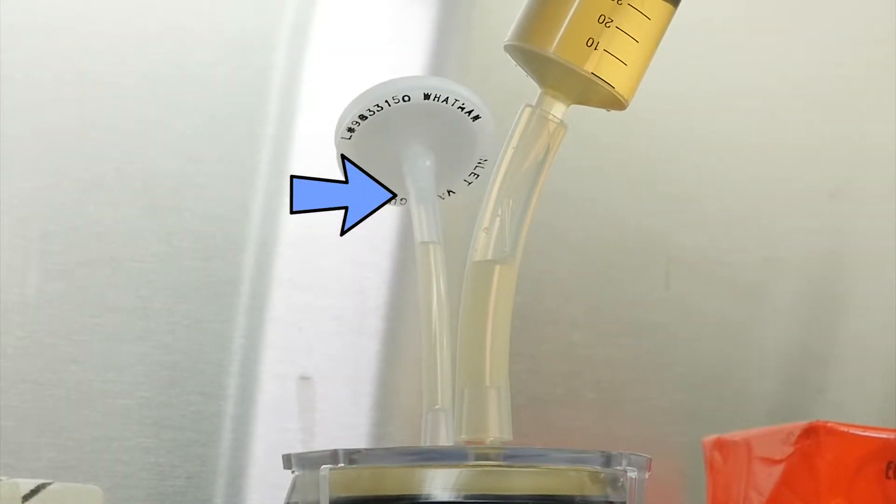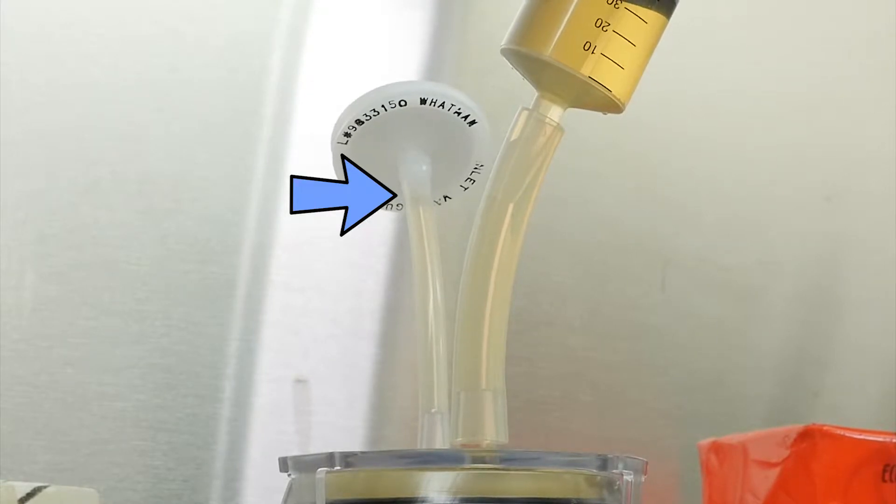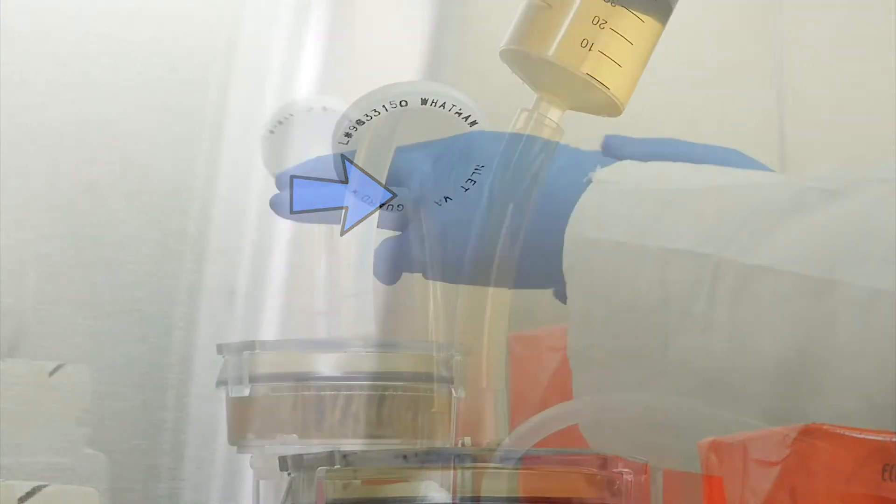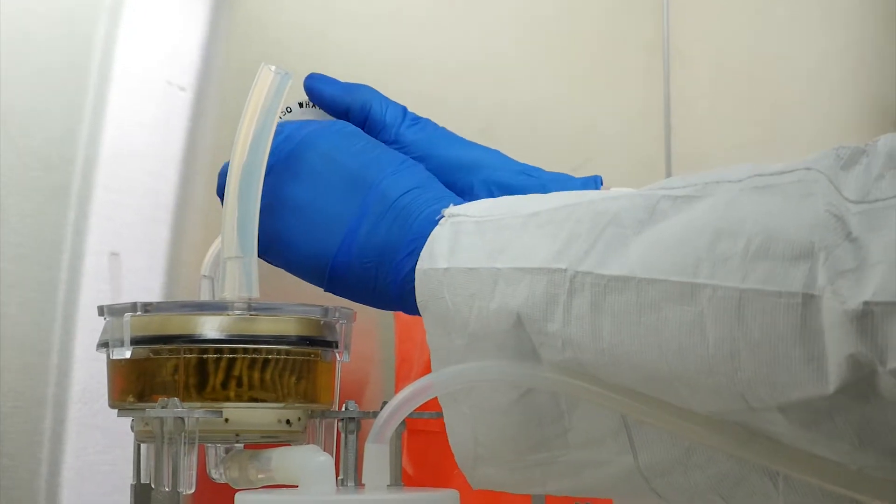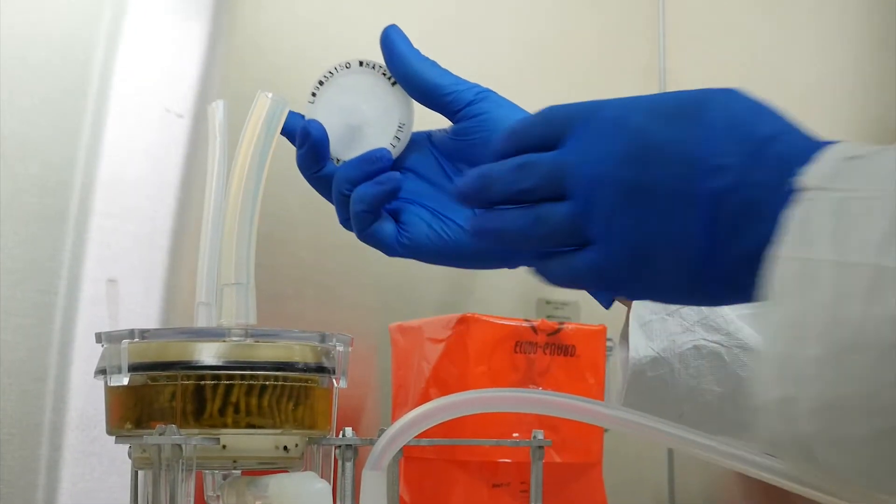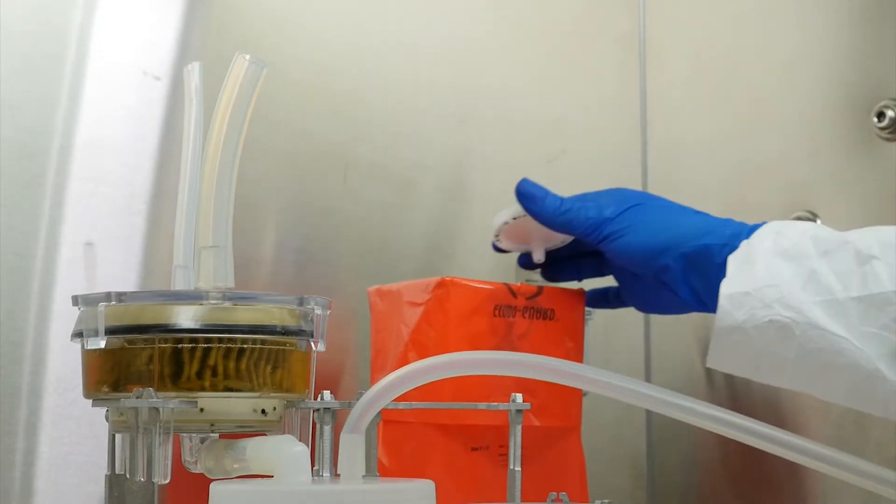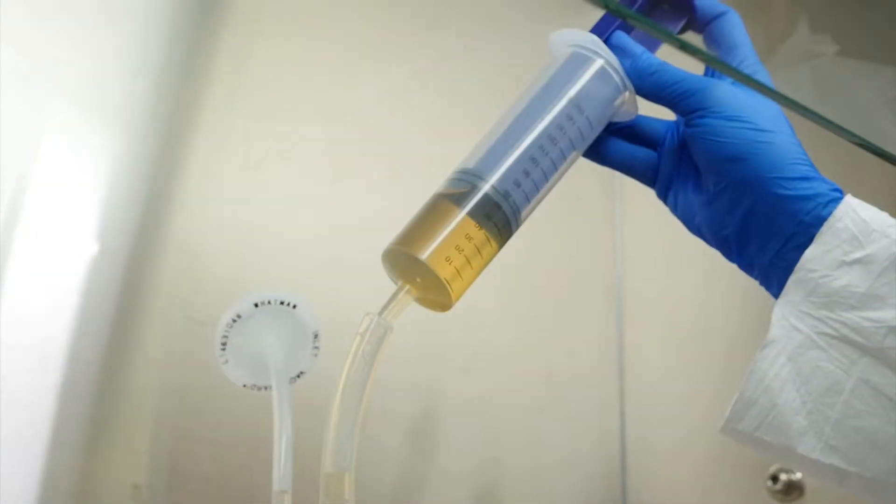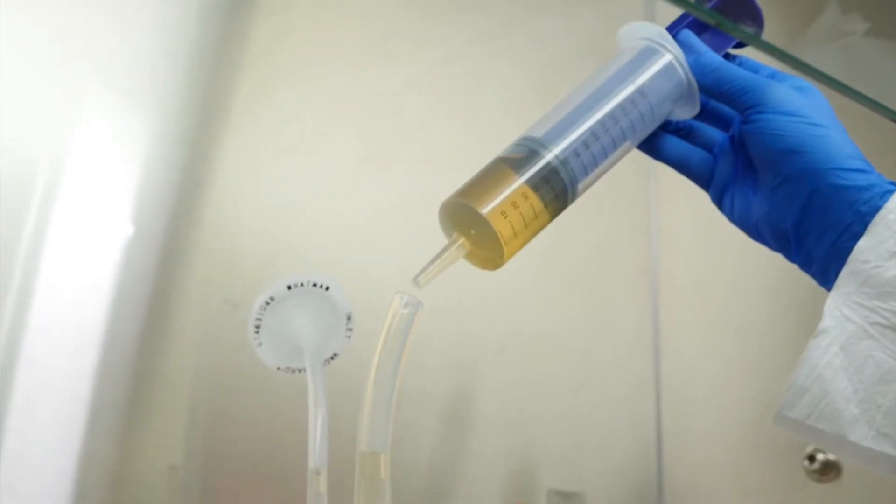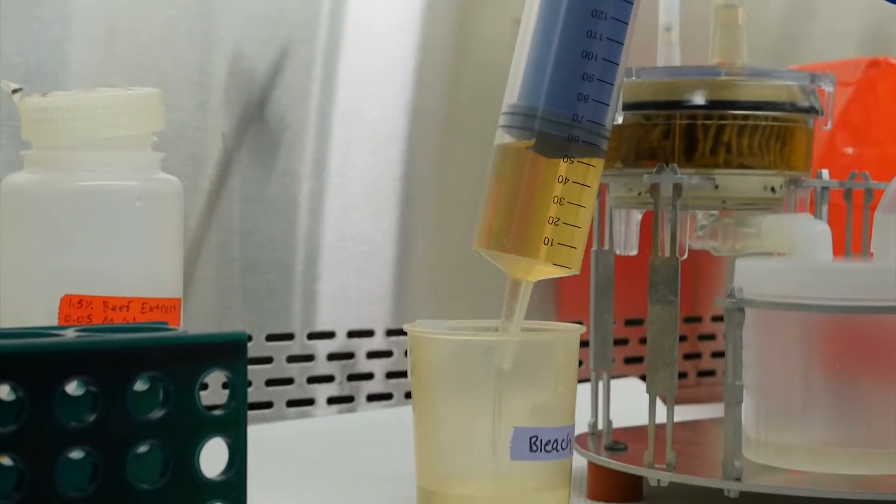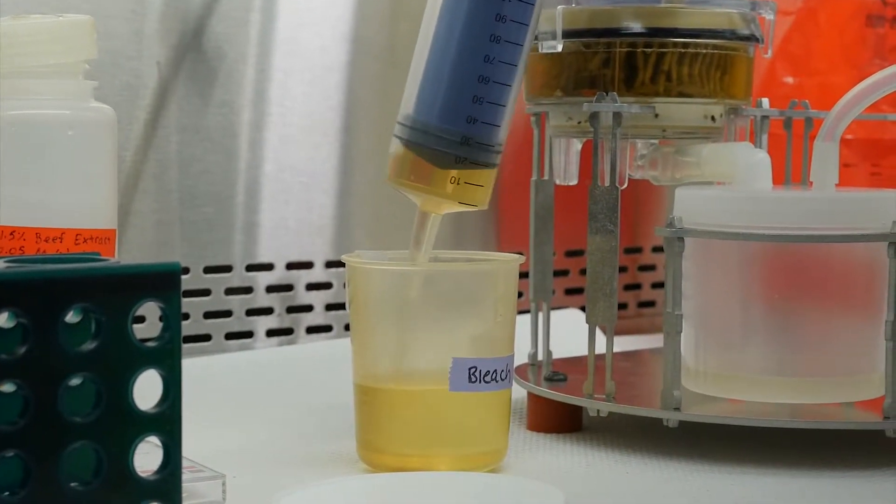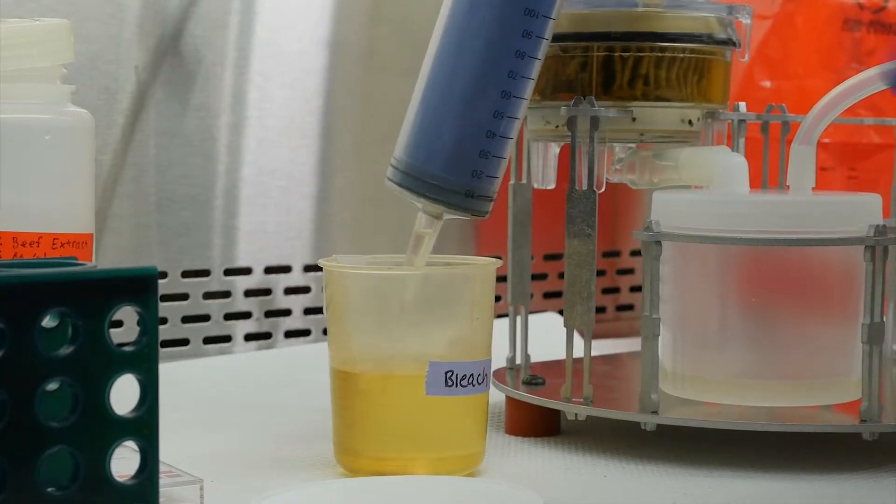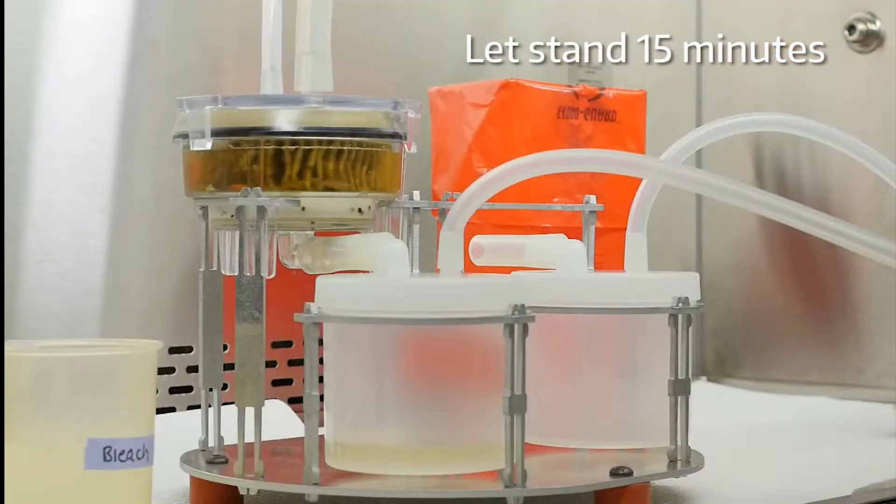As you slowly inject the beef extract, watch to ensure the liquid does not contact the VacuGuard filter. If the liquid does contaminate the VacuGuard filter, pause injection. The contaminated VacuGuard filter should be autoclaved and disposed of. Replace the VacuGuard filter with a new filter. If the ViroCap filter cavity completely fills with liquid prior to injection of the full 150 milliliters, stop injection and dispose of excess eluent into the bleach container. When eluent injection is complete, let the filter stand for 15 minutes to allow the organisms to desorb from the ViroCap filter.